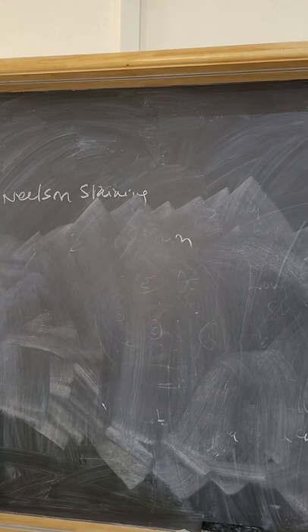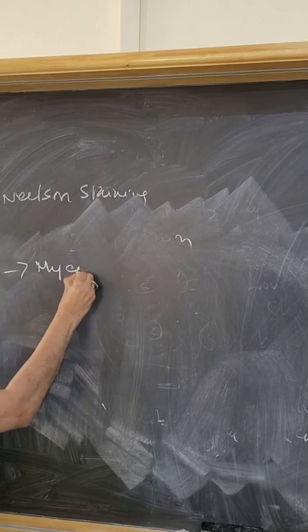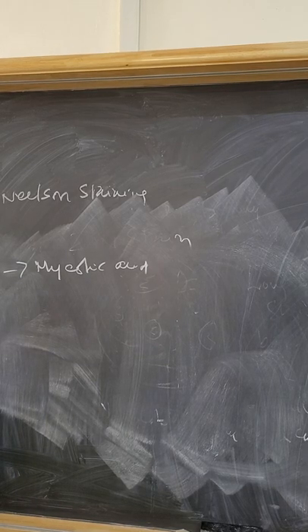First question they will ask: why are they acid fast? Your example and answer should be there. Mycolic acid. Why are they acid fast? Your answer should be because they have a lipoidal layer in the cell wall which is made up of mycolic acid. They are acid fast, sir.